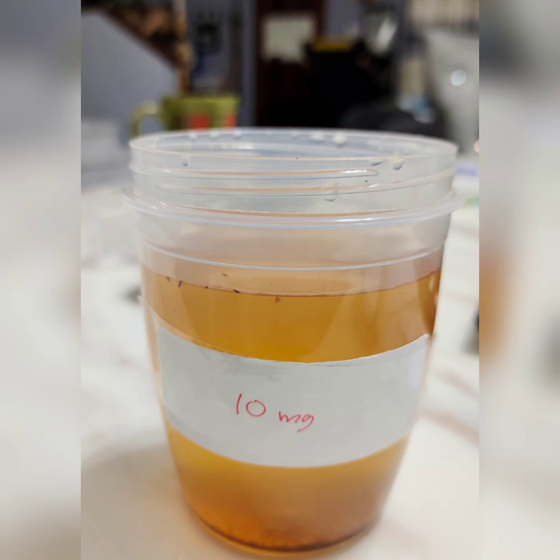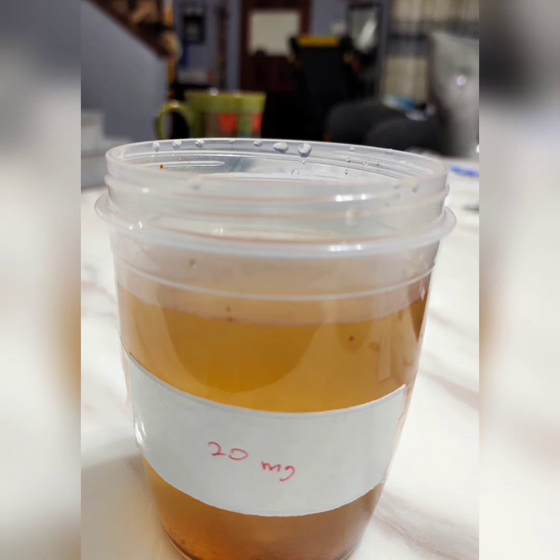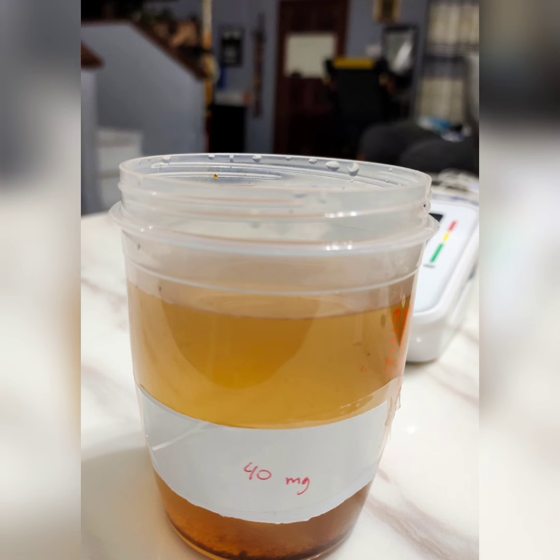Before that, we label the beakers according to the aluminum sulfate dosage that is going to be added, and this is each beaker with a different dosage of the aluminum sulfate.